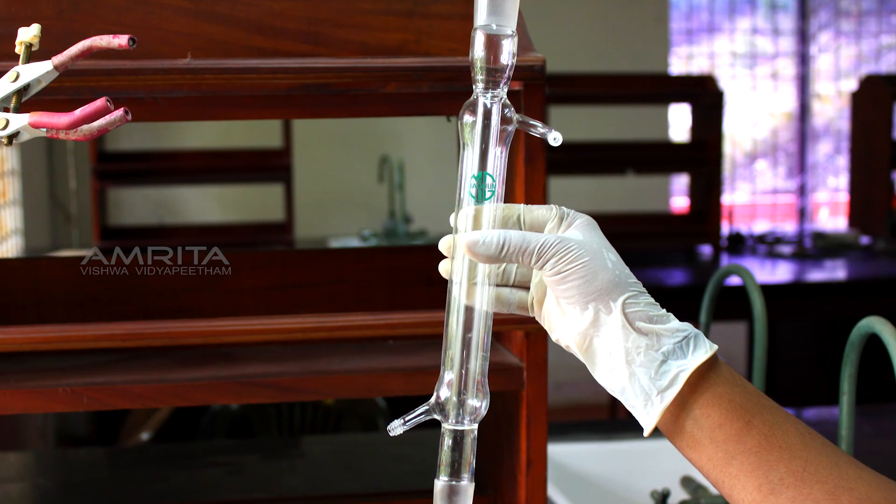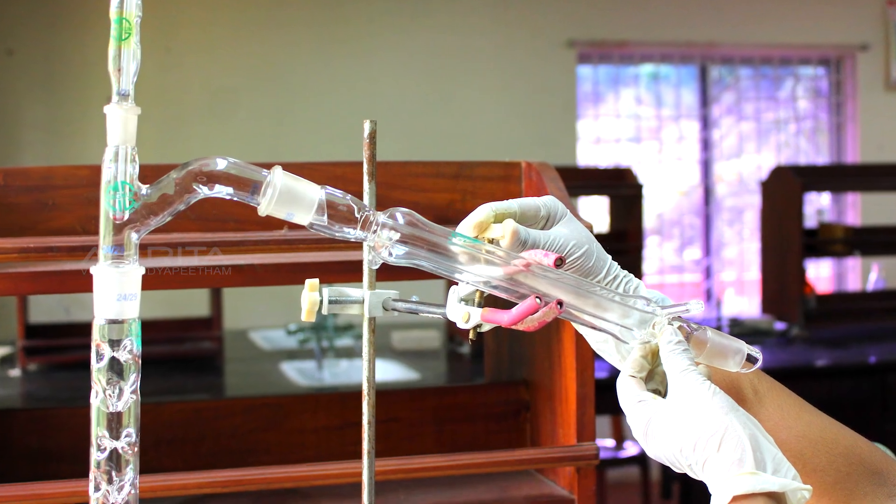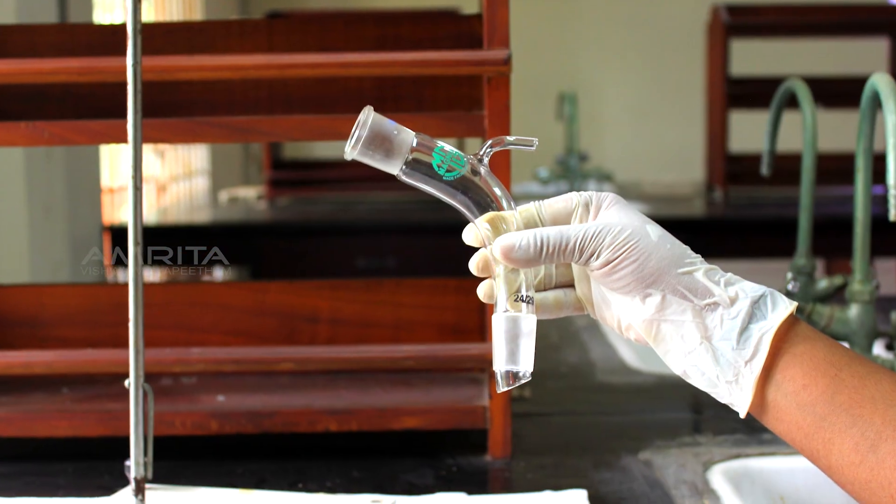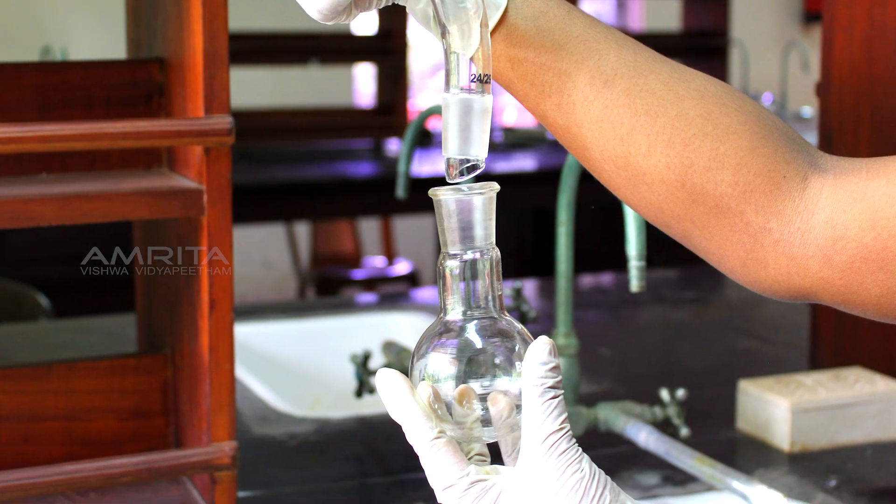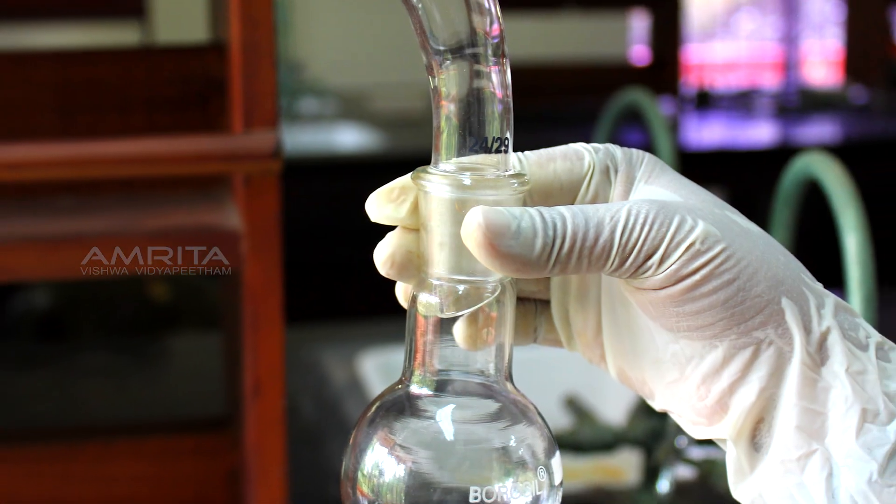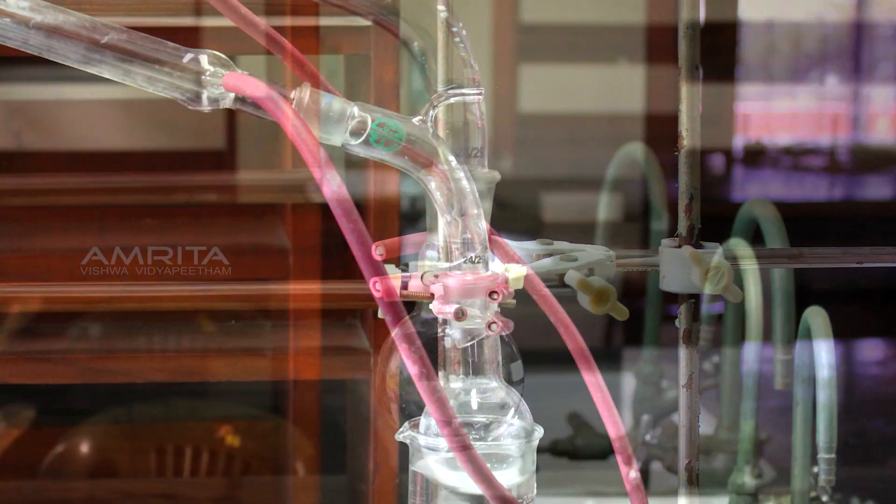Connect a water condenser to the outlet of the distilling head and clamp it. Now, connect a vacuum adapter to the water condenser and 100ml RB flask to the vacuum adapter. Clamp the RB flask and place it in a beaker containing water.